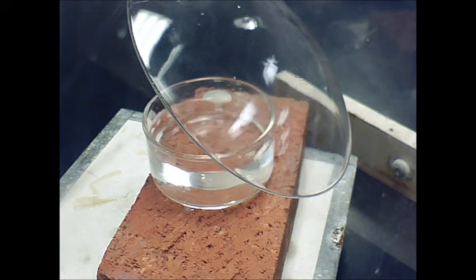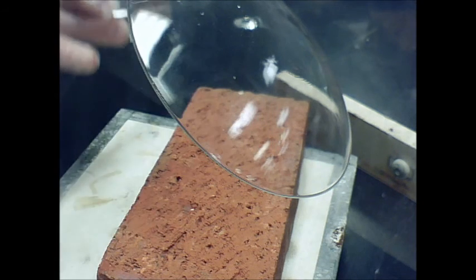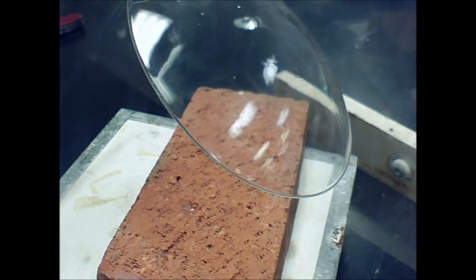All right, so that's just a chance for you to see one kind of reaction that can occur. You wouldn't think that metals would react with water that way. Iron doesn't, copper doesn't. The kind of metals you're commonly working with, that you have around your house, so if you're wearing jewelry, obviously your jewelry is made of a metal, and it's not going to react with water like that.